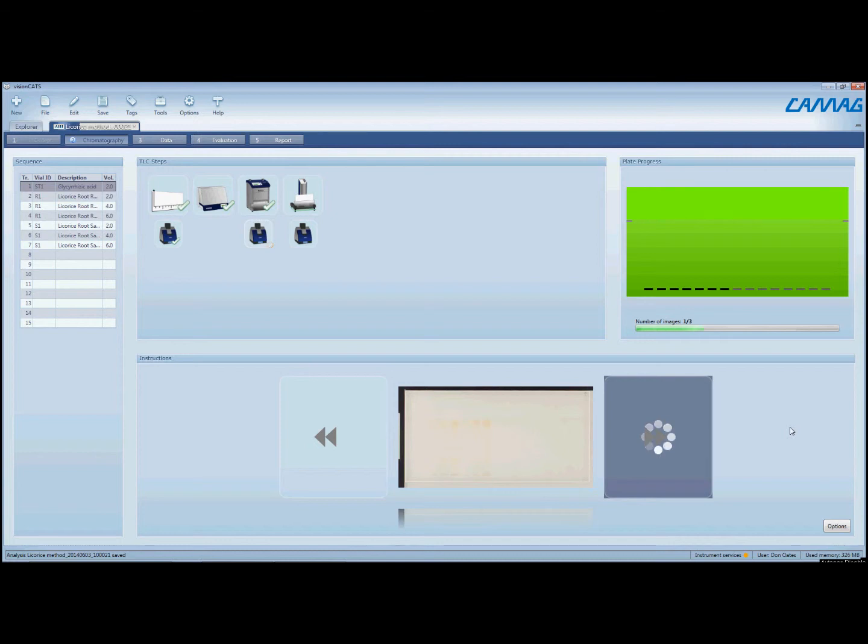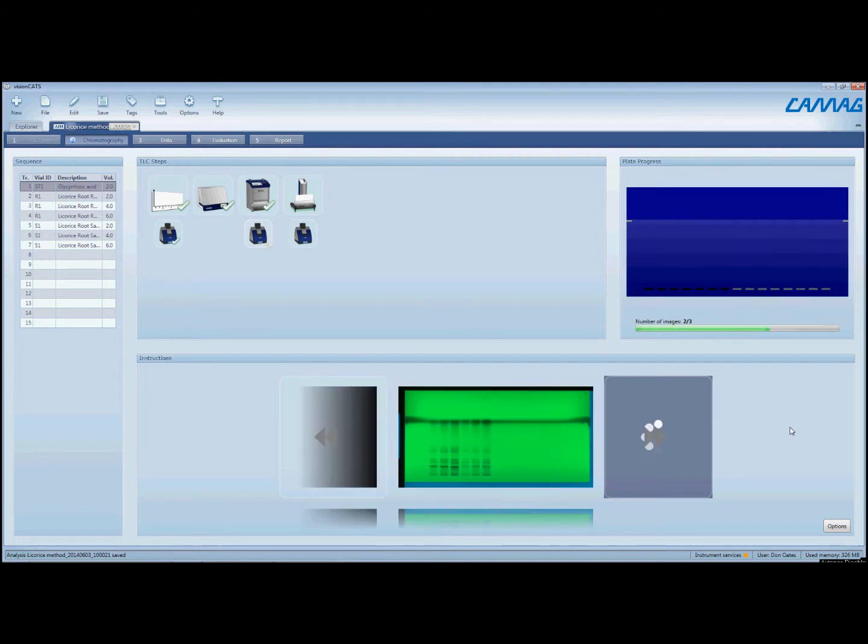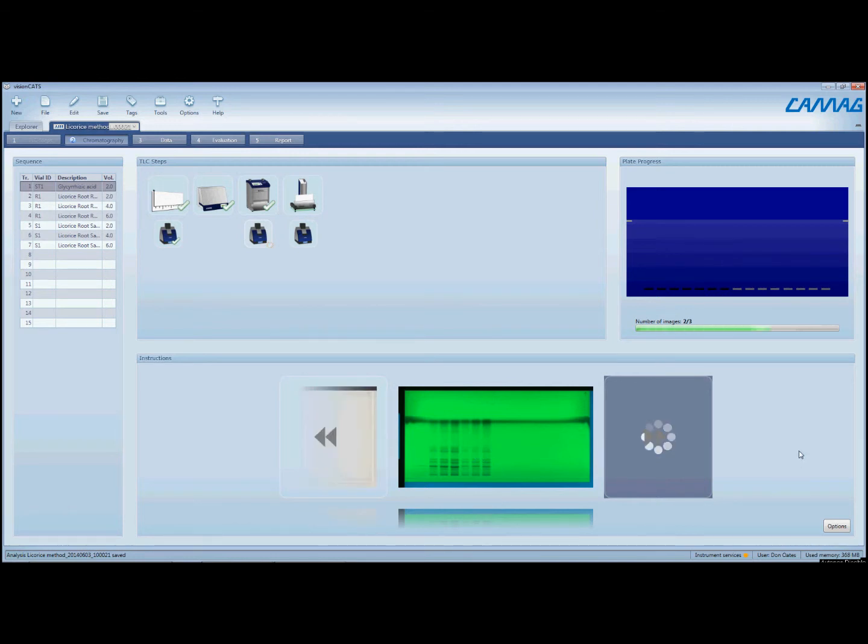We should be able to see some more detail under the different UV light sources. It's currently doing the 254, and there's our 254 nanometer image. And next and last will be the 366 long wave UV.